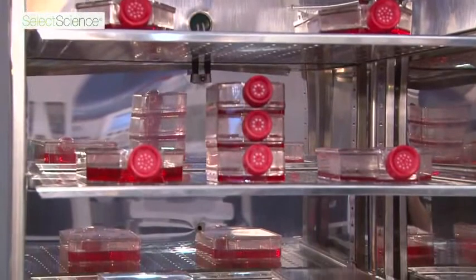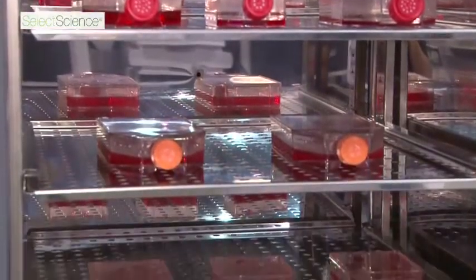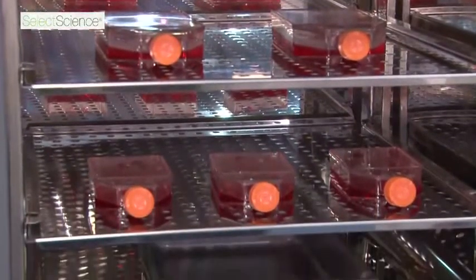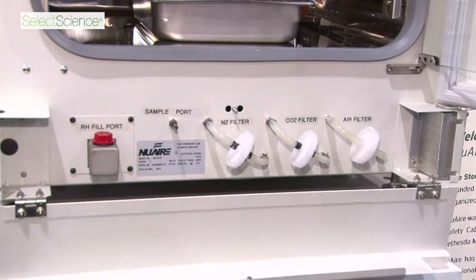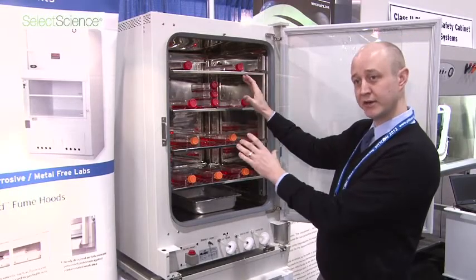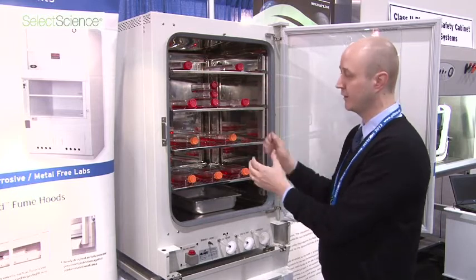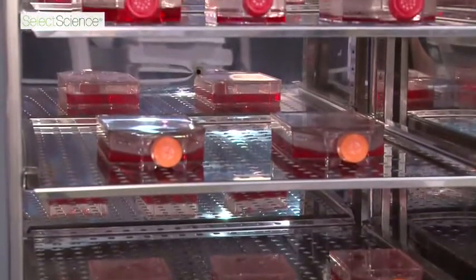What we are really focusing on with this unit is our constant contamination control system. We are making a mini clean room similar to an ISO class 5 clean room on the inside of the chamber. It is maintained at positive pressure. Here are your HEPA filters — very easy access, very easy to change, and very easy to maintain. It is a large interior chamber at 7 cubic feet or 200 liters, and it comes standard with four shelves but has the option for up to 21 shelves.